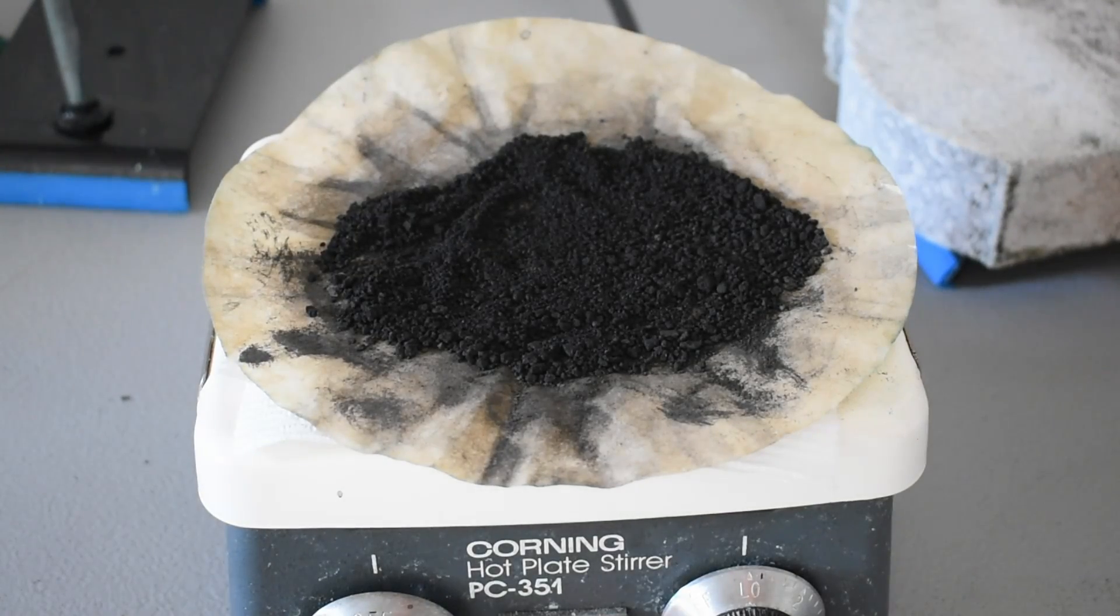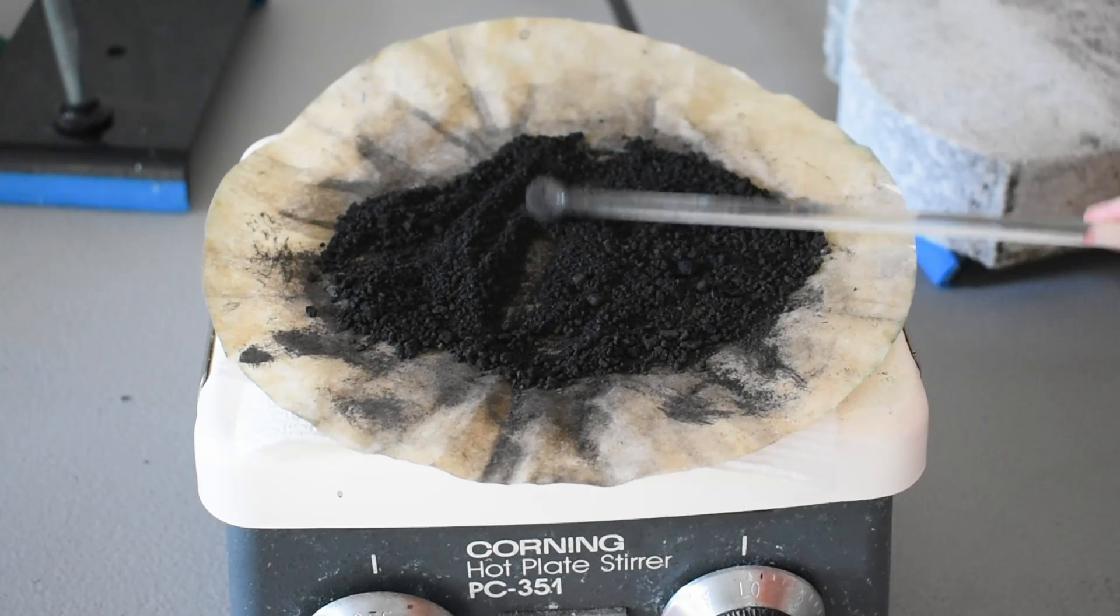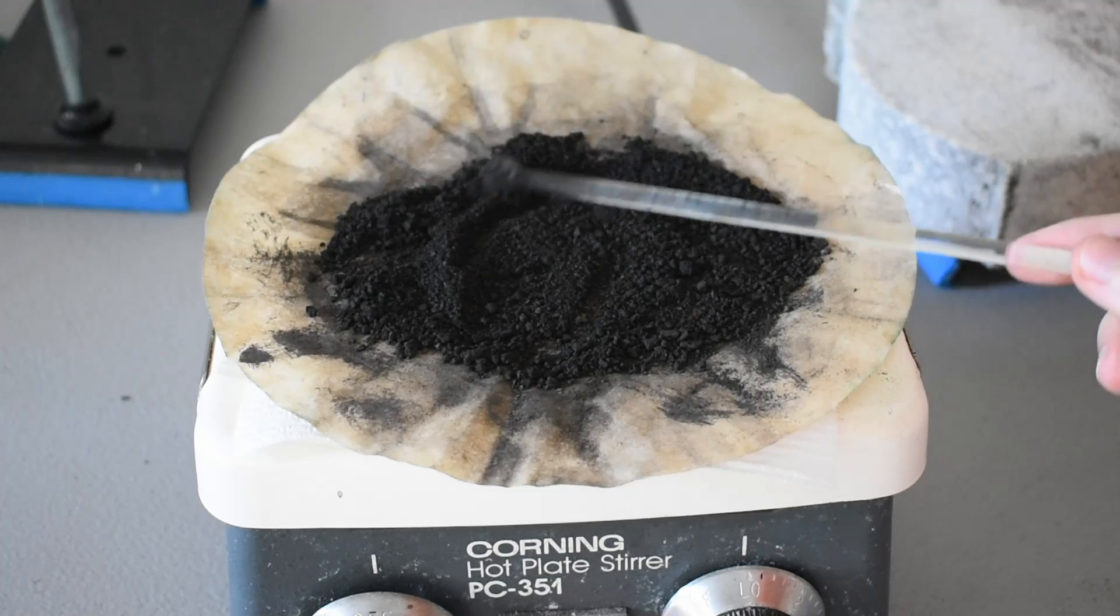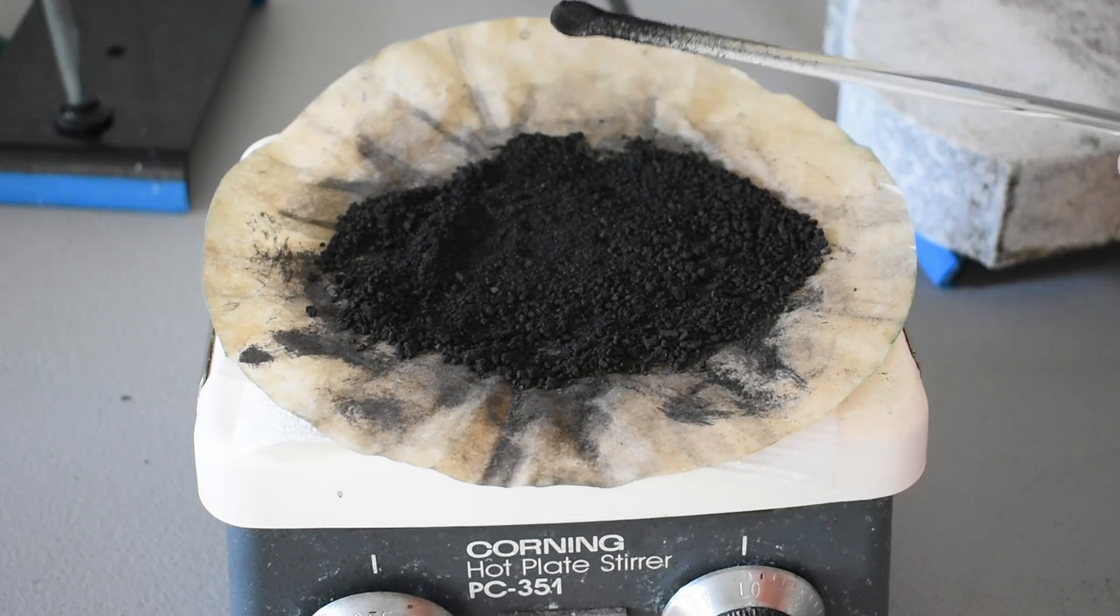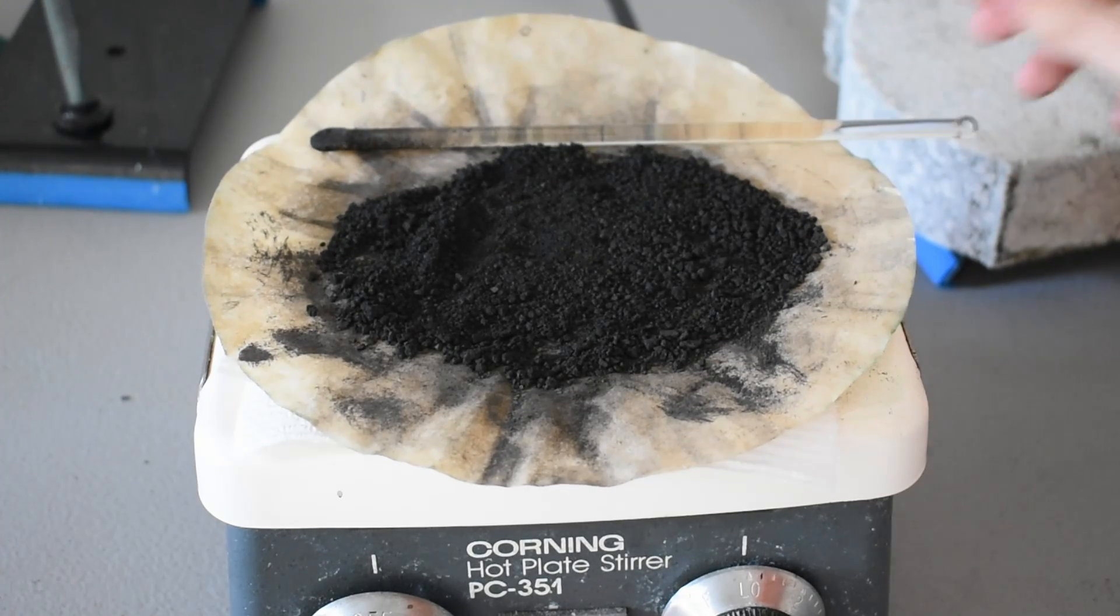Here we are after filtering. I've had it on the hot plate drying for a while. You can see it's a nice dark, almost black powder, still a little bit wet. So I'm going to leave it here to dry for a little bit longer. And then when I'm satisfied, I'll put it in a little container and we'll be done.